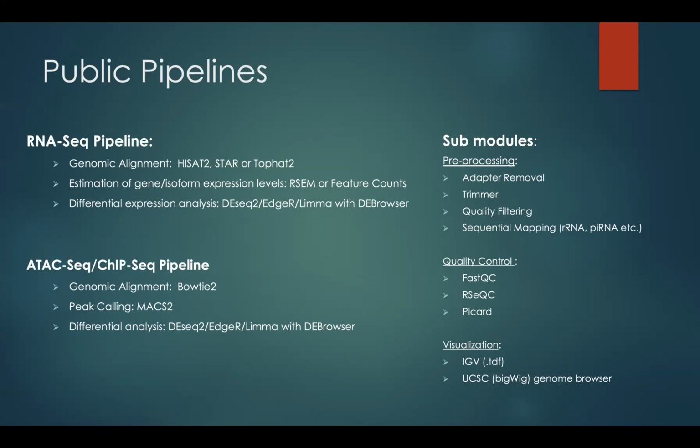So I am using sometimes both, sometimes just featureCounts, sometimes Kallisto, sometimes RSEM. Again, you need to do your differential expression analysis using these count files, and then look if you are losing a lot of DE genes because you used featureCounts versus RSEM, or because RSEM, because of the sophistication, just did something wrong. It could be possible too for some specific regions. Then you might choose featureCounts in that case. I'm not telling you this is better or worse. I'm just telling you that RSEM is using a more sophisticated algorithm.